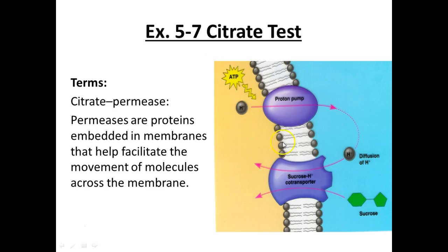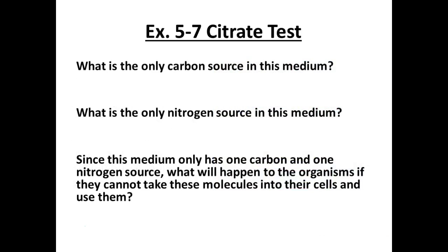Now, of course, my picture is for sucrose, but same principle. I couldn't find a citrate one, right? But it's going to take sugar into the cell. For each of the sugars and everything that these cells process, they have to have something to transport it into the cell. So some of your bacteria have this.